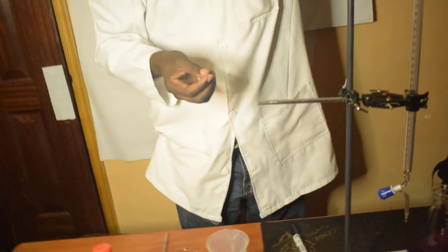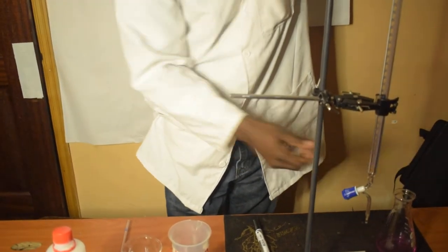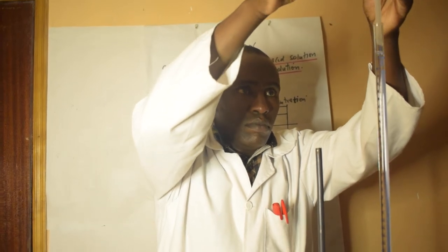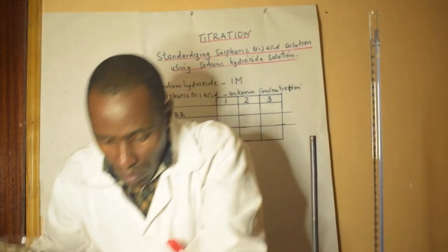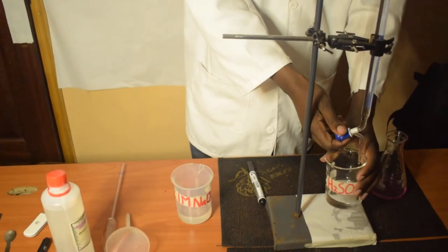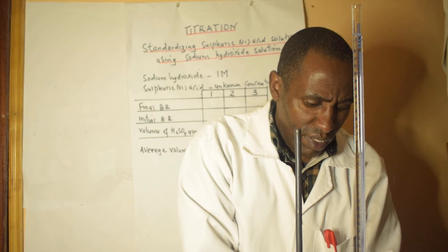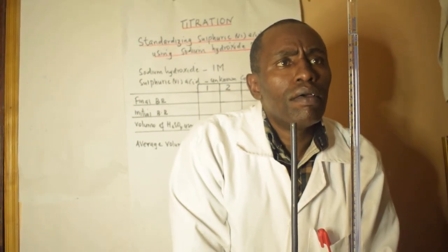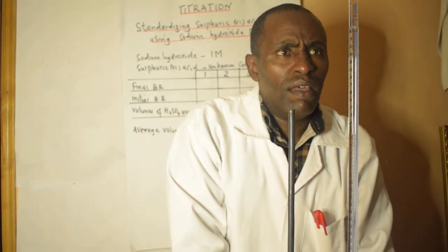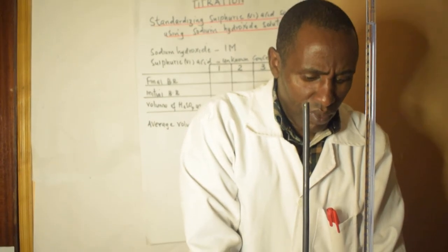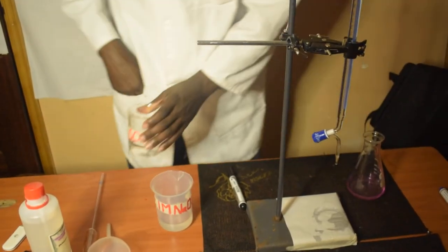The next step is to fill my burette with the acid — the acid whose concentration I need to determine. I'm supposed to lower its volume to zero mark, so the meniscus should be at zero. Exactly — the burette reading is zero.